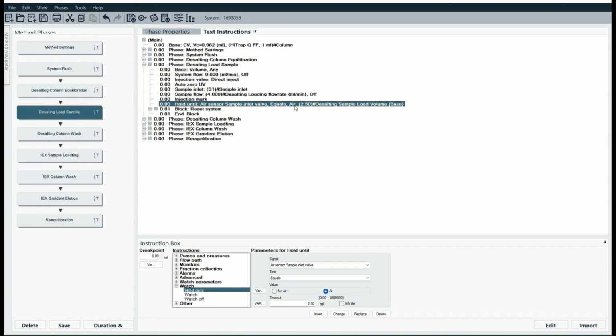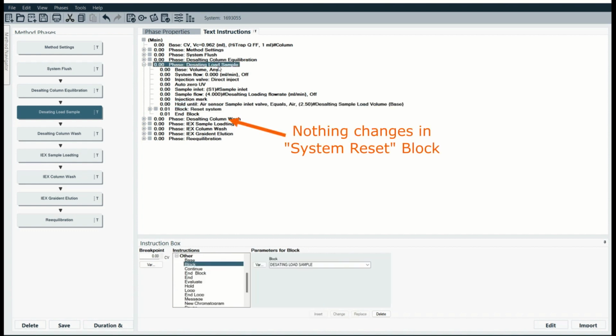And as we load it back onto the ion exchange columns, hopefully the volume will be about 5 mils, and the concentration will be about 1 mg per mil, which is almost the same conditions that we had when we did all of the resin selection stuff. That is loading the sample.